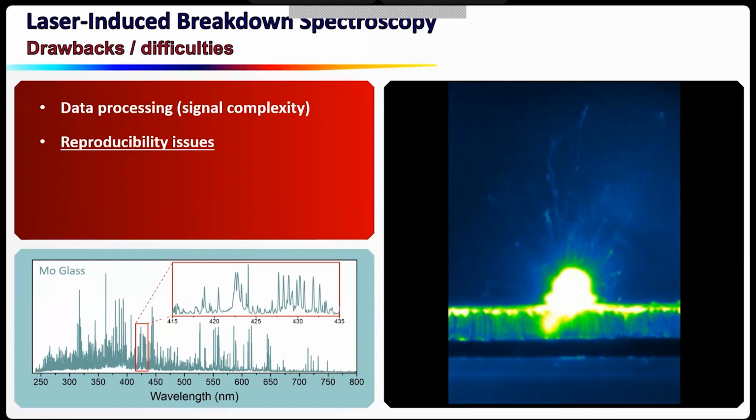It's 10 images per second, 10 pulses per second. As you can see, the plasma shape really changed dramatically. And then you go through your 1 millimeter aluminum. It was just to show you that it is very easy to produce a plasma, but to be able to stabilize this plasma, to reproduce it in very stable conditions, is not so easy.